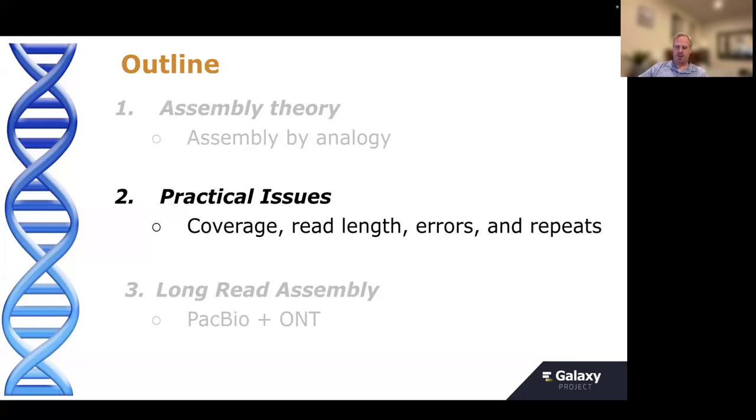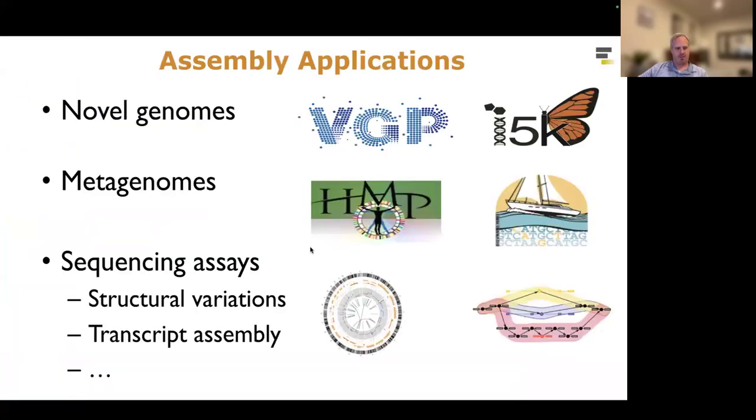Now, if we're going to do this as a real experiment, there are some real practical issues that you have to pay attention to in order to get a good genome assembly to come out of your species and come out of your project of study.